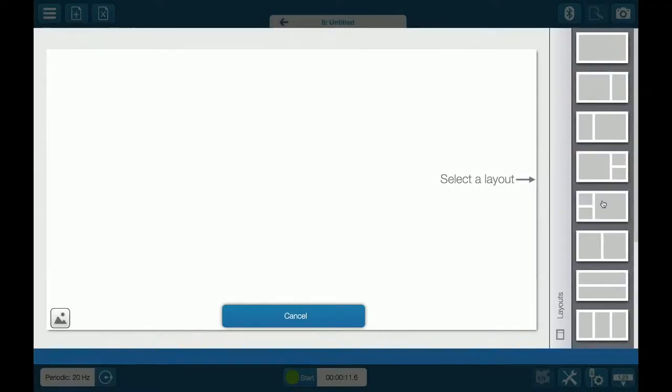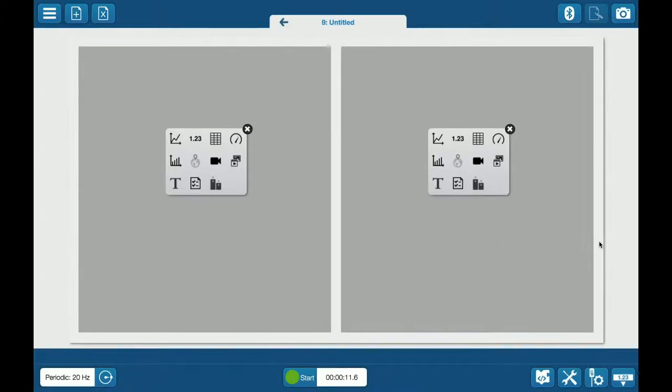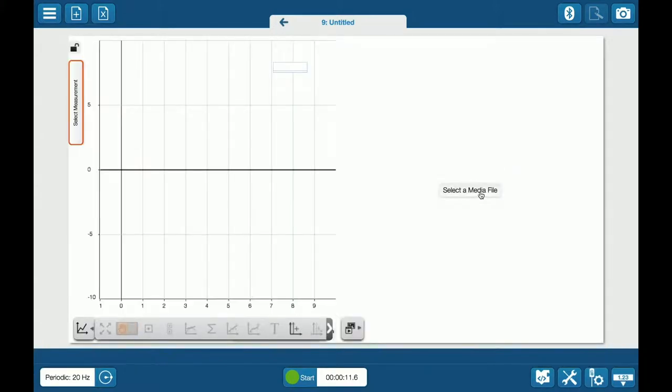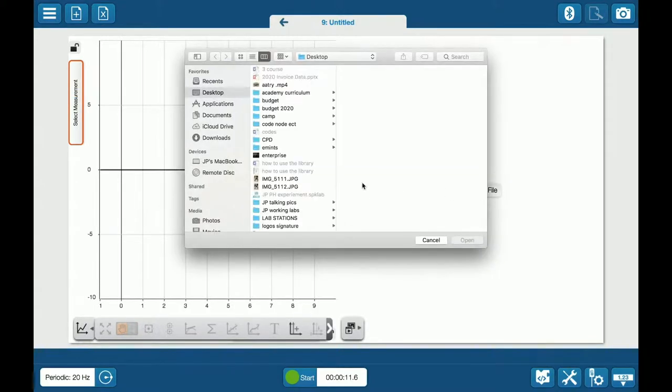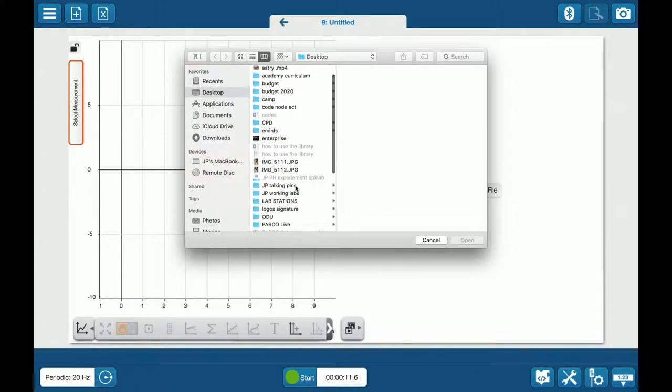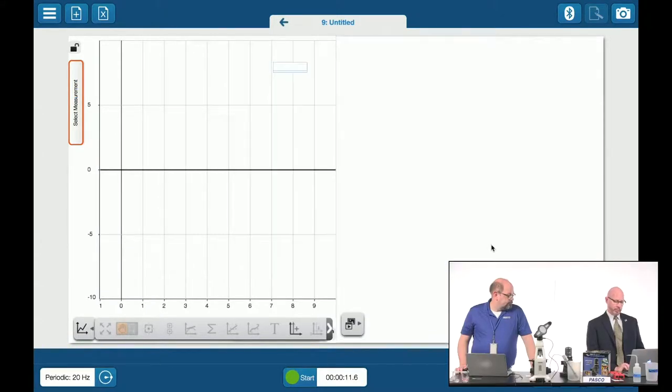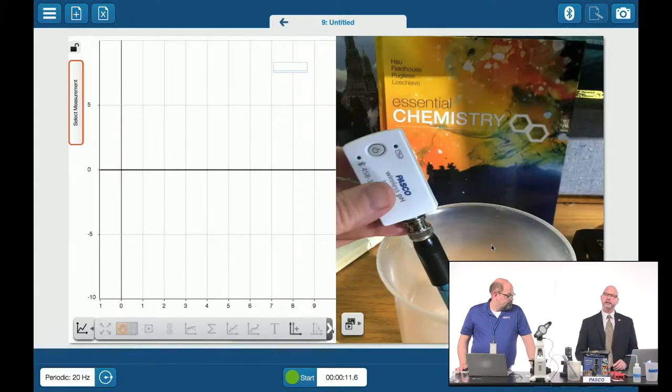I'm just showing you how very easy it is for me to open up a slide that I want to build for my students. And maybe on this side, I want to put a graph. And on this side, I'm going to put that image. And this is where we were talking about Roger's been pulling images right off of the microscope. But in this case, maybe I want to pull an image like a picture that I took that I've got here on my desktop. And so I pull that image off of my desktop and I drop it right in.